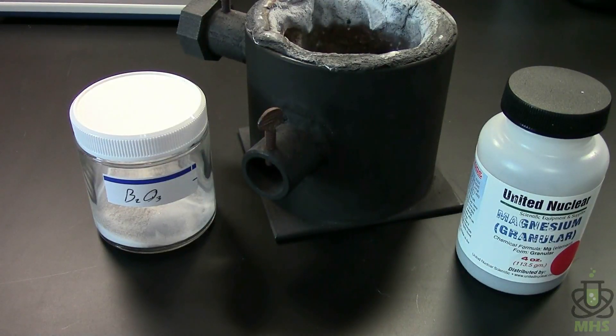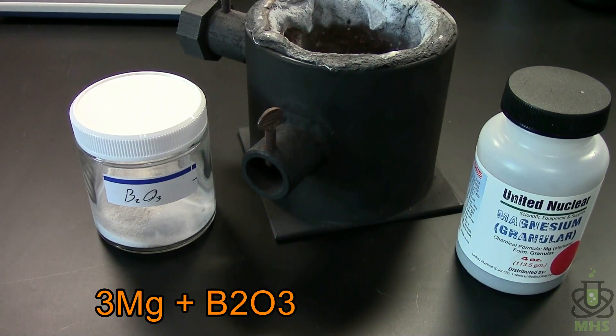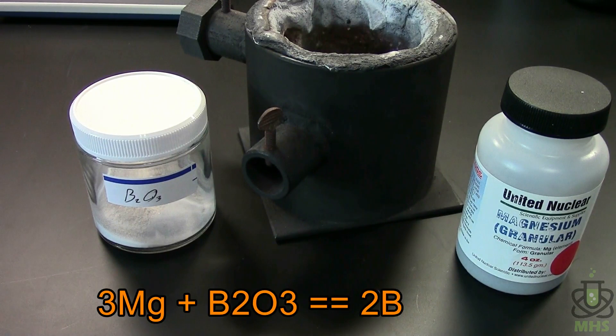The next step is to make our boron via reaction with magnesium. We need powdered magnesium which we'll mix with our powdered boric oxide, and that's going to react to produce our elemental boron and magnesium oxide. That's the main reaction.